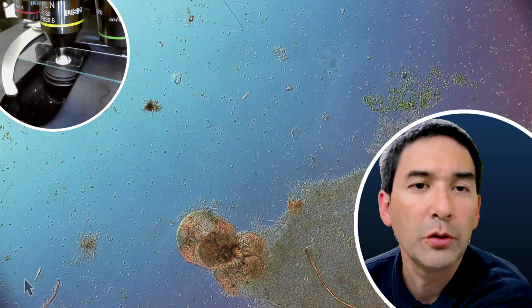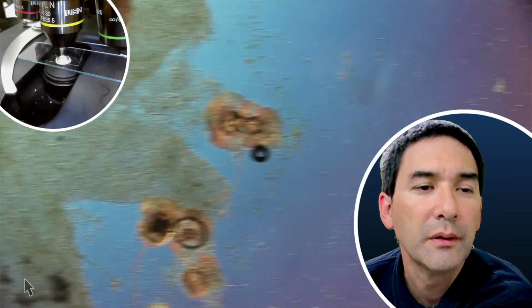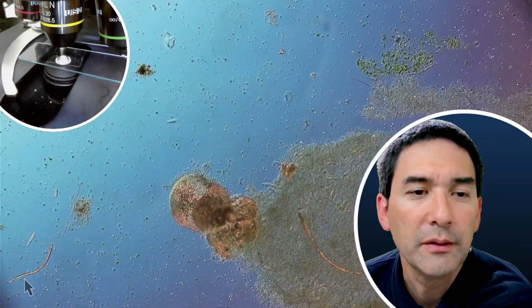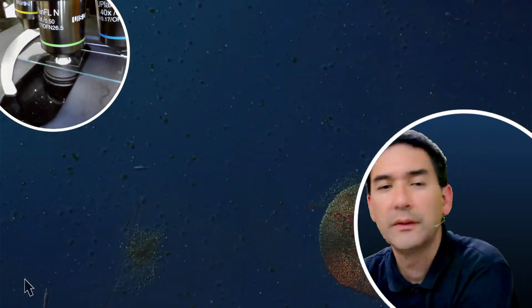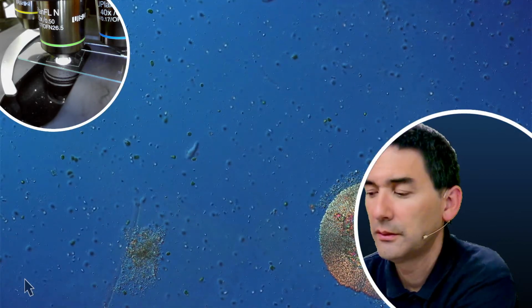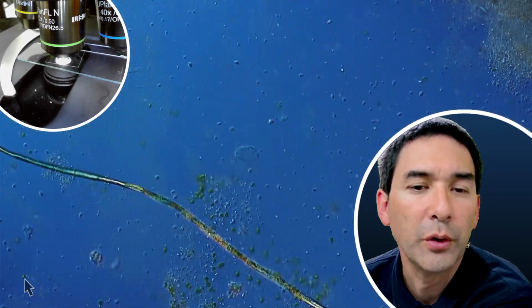Yeah, so basically not much happened since last week. I see pretty much the same. But I do have to increase the magnification a little bit. Yep, so you see that there's plenty of stuff going on here.